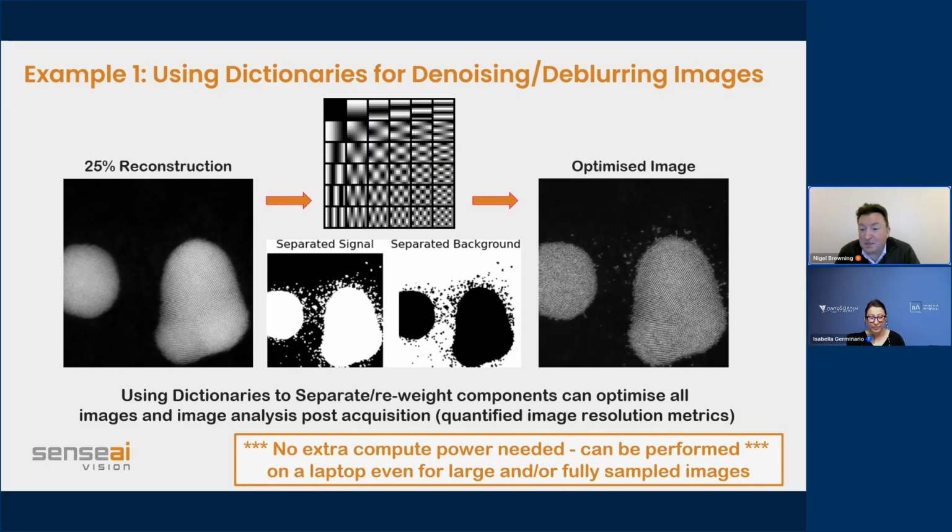And if you have some data that you think will be different, we're more than happy to run it through our system and give you the error metrics. We do that every time for people who inquire about using this. A lot of times they send us an image to say, what can you do with this? And we can go back and just quantify what that reconstruction is that comes out of it.